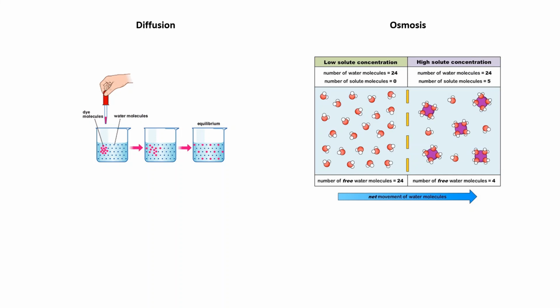Today's lab is going to be all about diffusion and osmosis, and what you're going to see in a little bit is me doing a simple diffusion experiment followed by a simple osmosis experiment. Before we get to that though, I just thought to give a little overview and reminder about diffusion and osmosis.